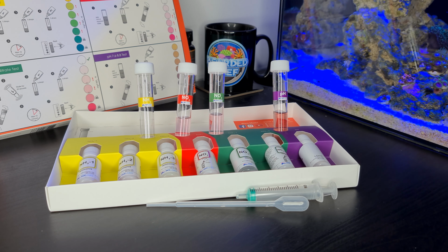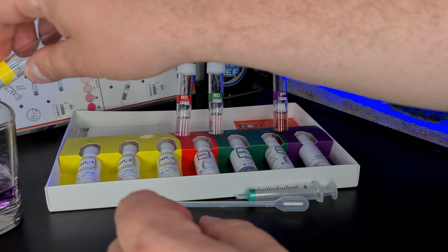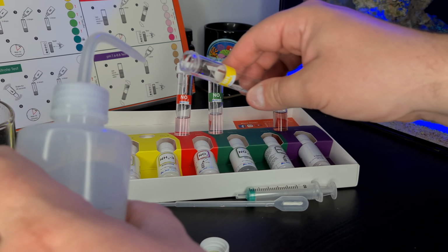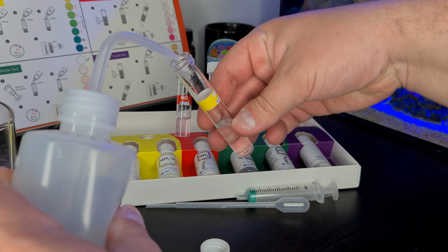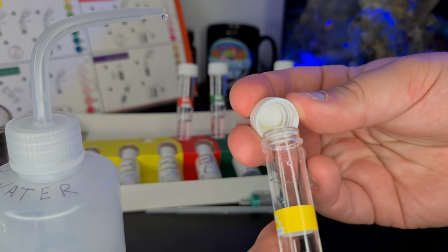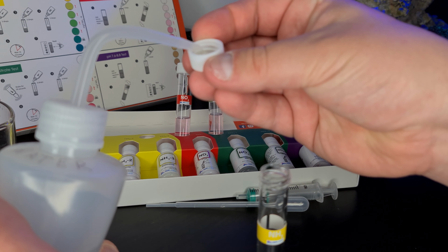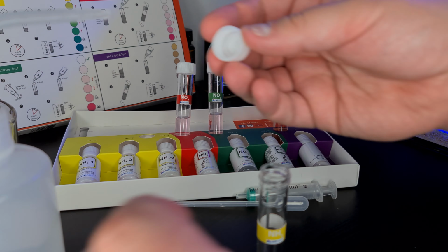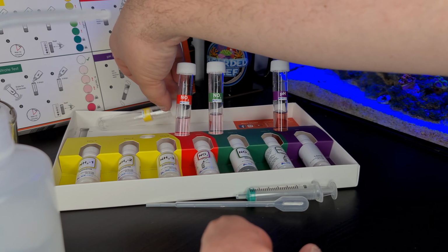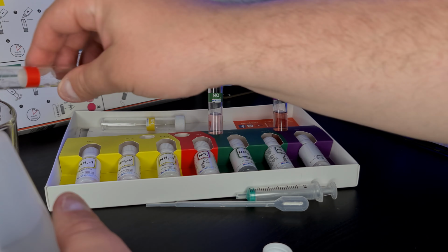So the last thing that I'm going to do is just give everything a quick clean out. I had done some tests earlier in the day, so I've got a little glass there that I just pour everything into. So all I do when I'm cleaning these out, so just pour that little glass there. Then I've got this squeezy bottle with RODI water in it. So just squeeze some of that in there, give it a little rinse about, and then pour that in there. I'll just give the lid of this a little clean as well, because there's something in the lid there that I noticed. And yeah, it's as simple as that. We'll do that for all these, get them all cleaned out, and get everything packaged away, but like I say, quite impressed with that.